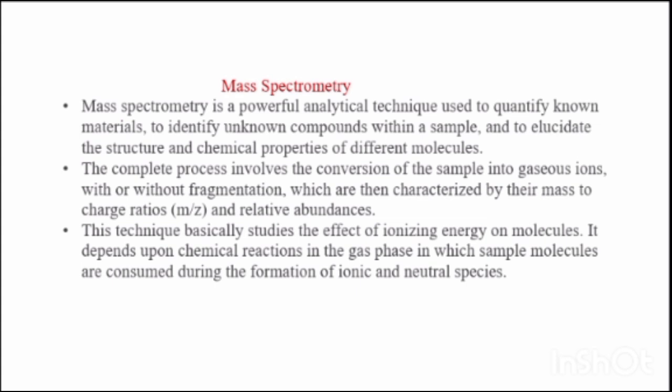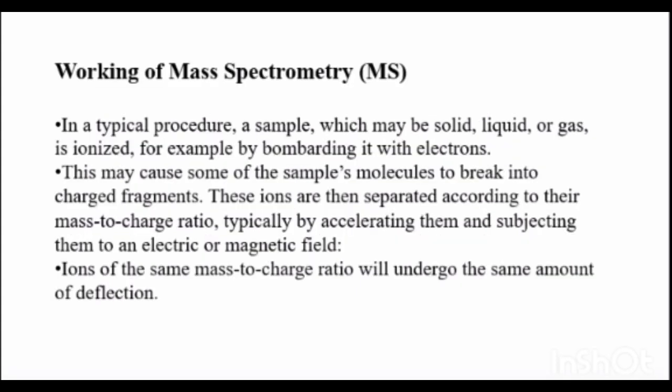This technique basically studies the effect of ionizing energy on molecules. It depends upon chemical reactions in the gas phase in which samples are consumed during the formation of ionic and neutral species. Then let's see about the working principles of mass spectrometry.